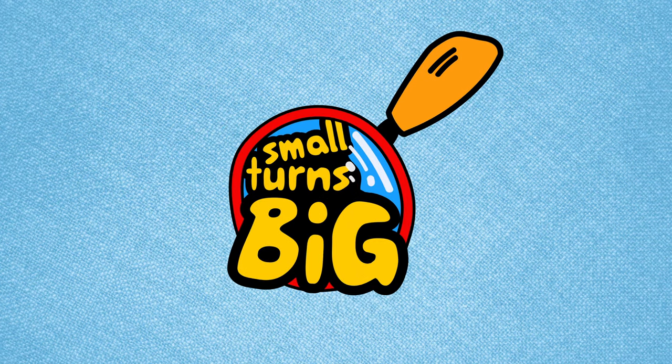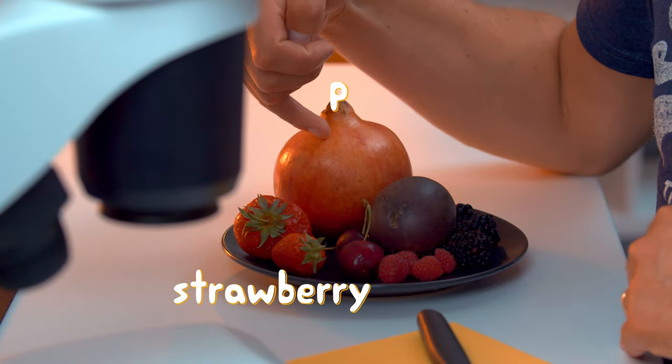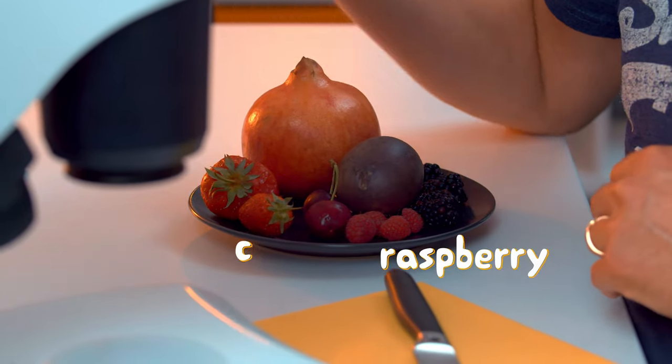Imagine we find a worm inside one of these fruits — what is this, is this a worm? Hello guys, welcome to Small Turns Big. When we look at these fruits under the microscope at 100x magnification we can expect a lot of interesting things. We got a strawberry, a pomegranate, passion fruit, blackberry, raspberry, and some cherries.